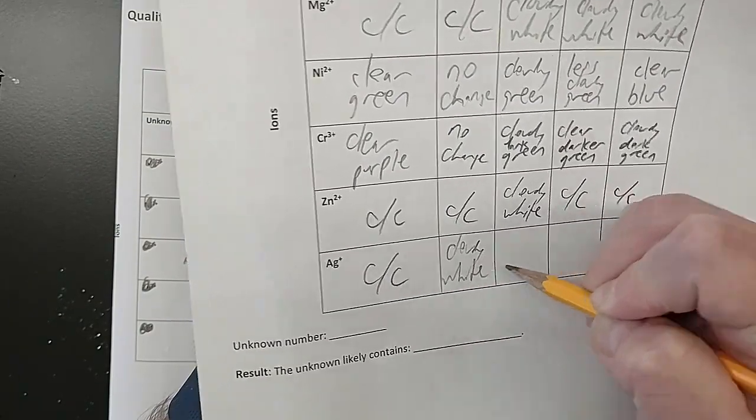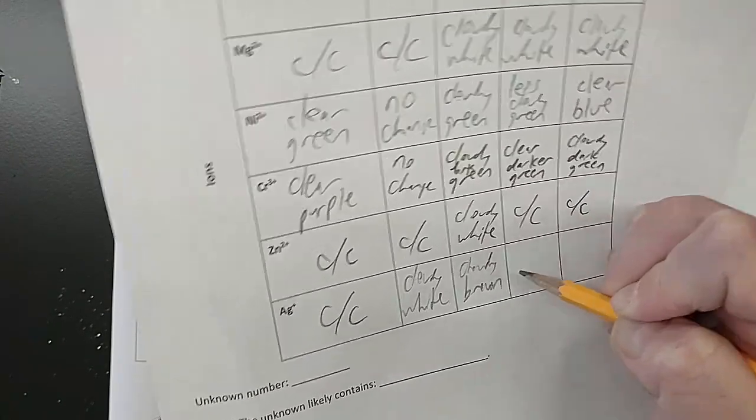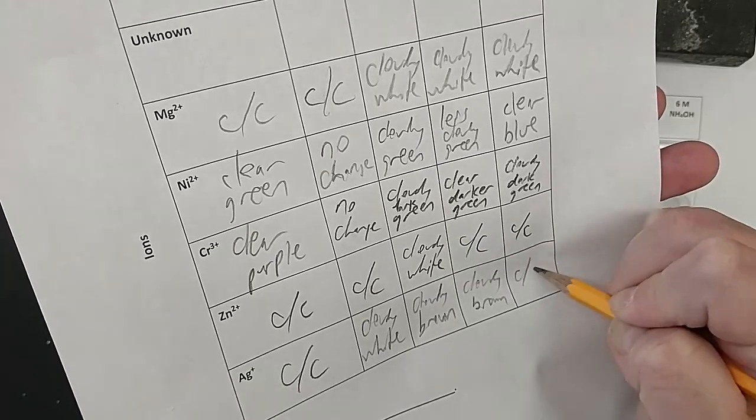Cloudy white. Cloudy brown, I'm going to call it. Also cloudy and brown. Clear and colorless again.